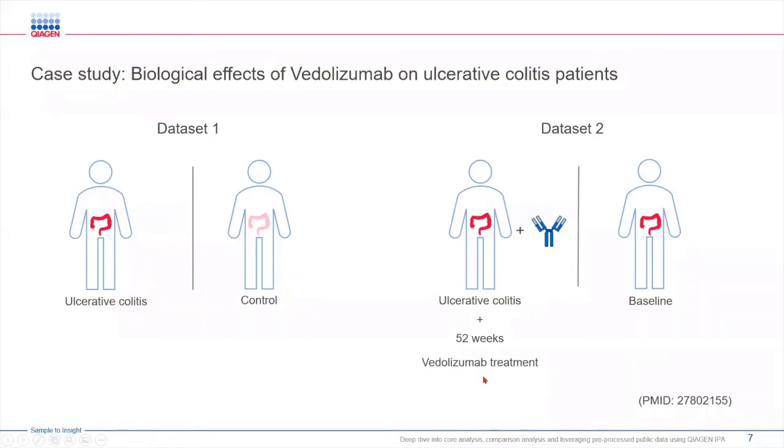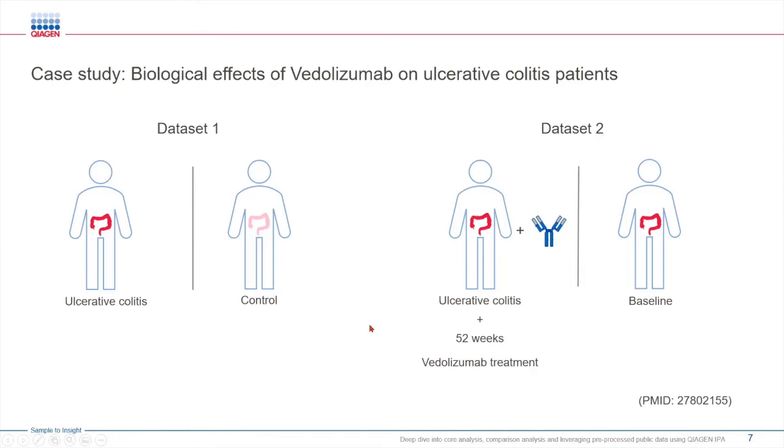For the second data set we have treatment versus baseline where ulcerative colitis patients were treated with vedolizumab which blocks leukocyte trafficking in gut. Let's see how we can leverage IPA to identify relevant upstream regulators, mechanistic networks and causal networks.